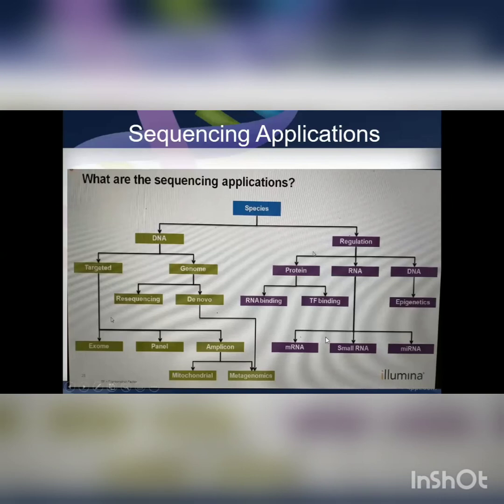So when we come to mRNA sequencing, this has become the method of choice to analyze the transcriptomes of many disease states. And it is much more accurate than microarrays, and it can capture both known and novel features. It can be applied to a wide range of species. Coming to small RNA. Small RNA sequencing is necessary because these are also known as non-coding RNAs, and they act in gene silencing and the post-transcriptional regulation of gene expression.